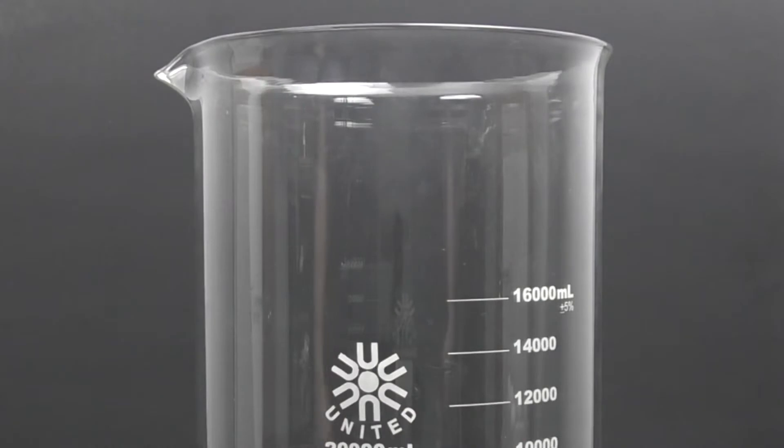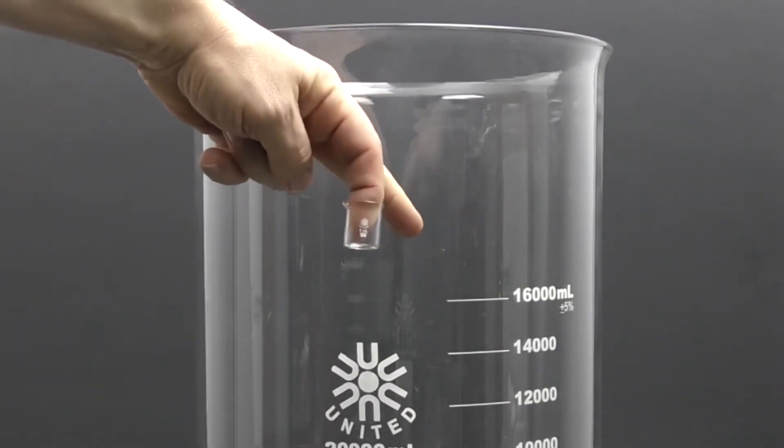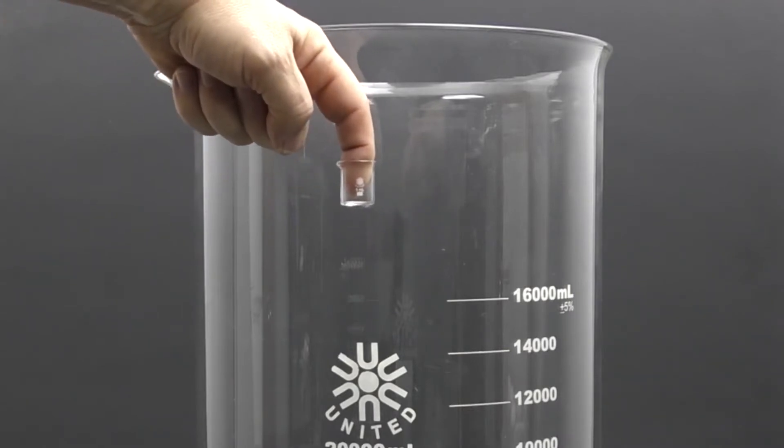To give you a better idea of the scale, here is our 5 milliliter beaker, and here is our 20,000 milliliter beaker.